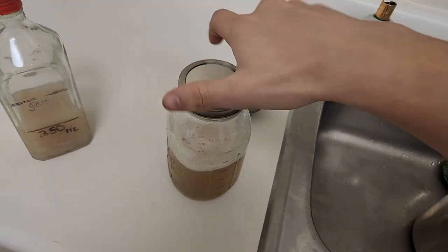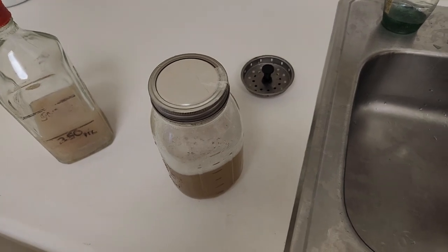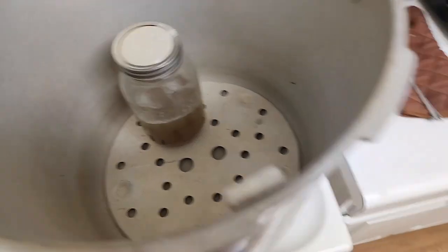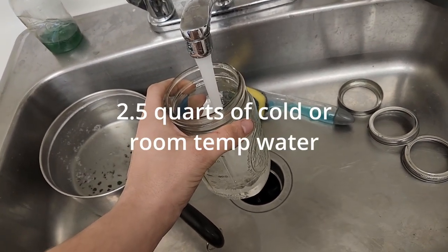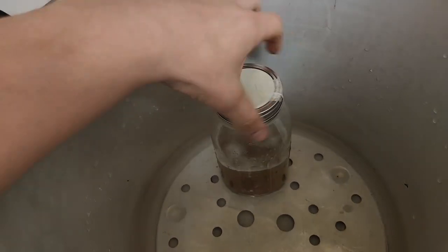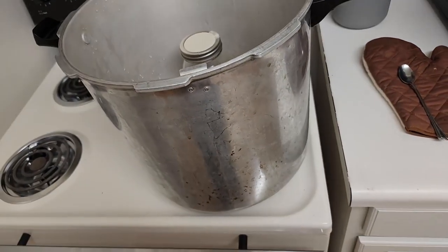Go ahead and put this in a jar, unmodified lid. I just flip the lid and leave it slightly loose. And I'll show you how to pressure cook it. Okay. Now you're ready to pressure cook your agar. Very simple, just put it in the pressure cooker. Prep 2.5 quarts of water. And just make sure that the lid is loosened about a quarter turn. And that's it. I don't put tin foil on top. Don't do anything. Just pressure cook it.